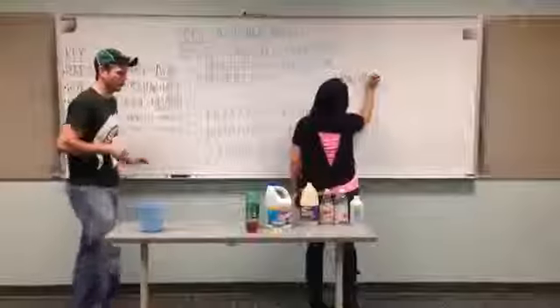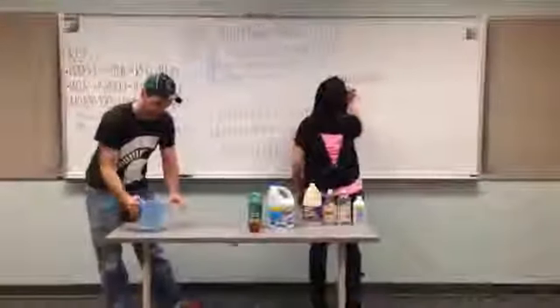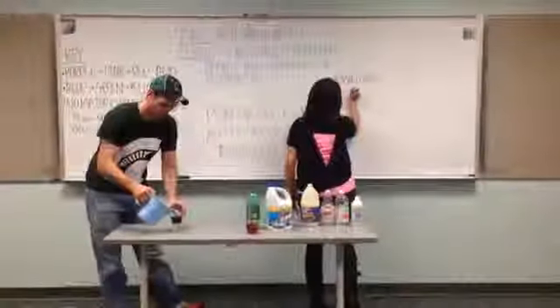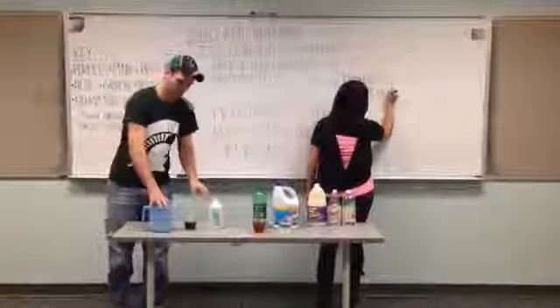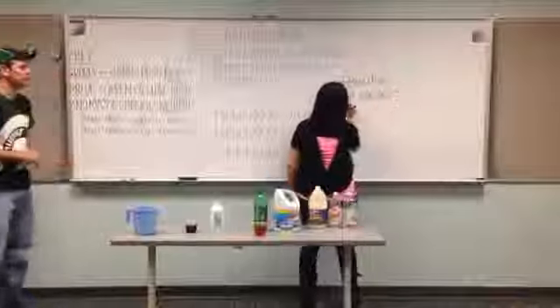Okay. And while you're doing that, I'm going to go ahead and pour your indicator. And I'm going to pull your alcohol out for you. And when you're done writing that, go ahead and test that out.